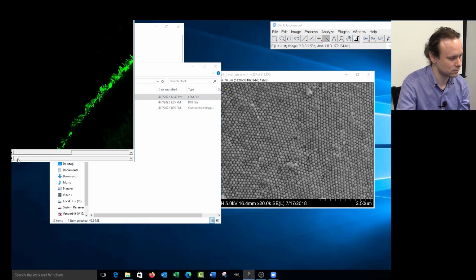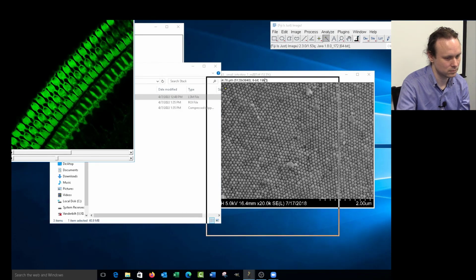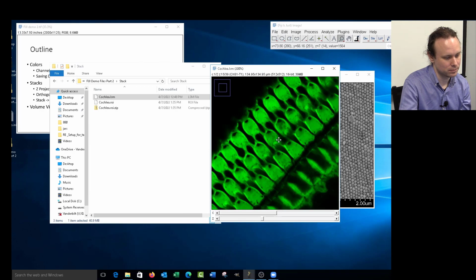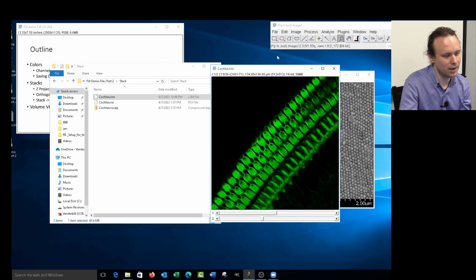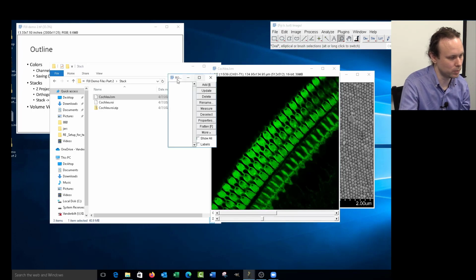Quantifying vesicles inside a cell for area can be extrapolated to quantifying something inside of something else, right? Cell, nucleus, vesicles, those can be whatever those things are. So this would apply to other things. Yeah, so how I would do this, let's get our ROI manager open.